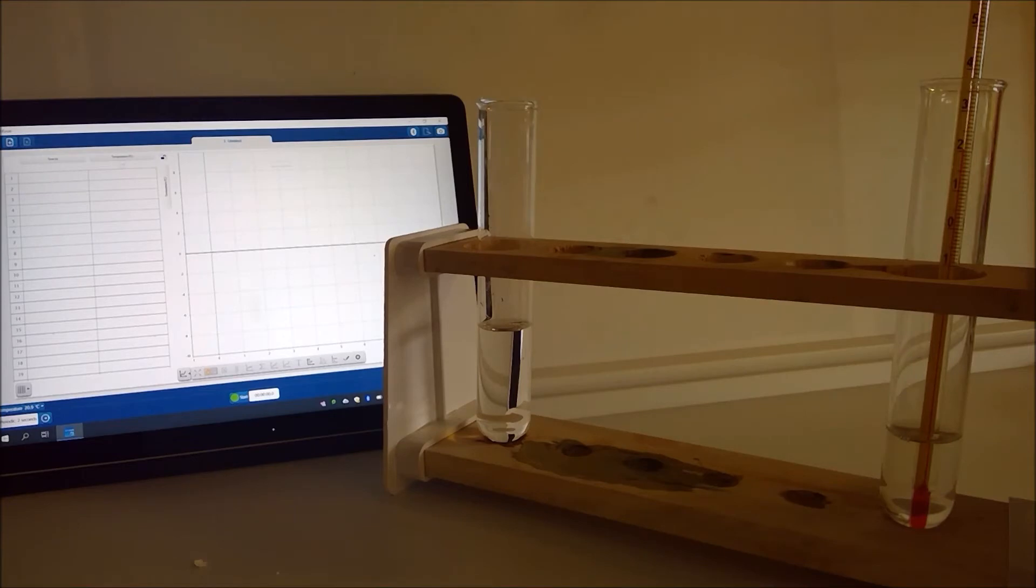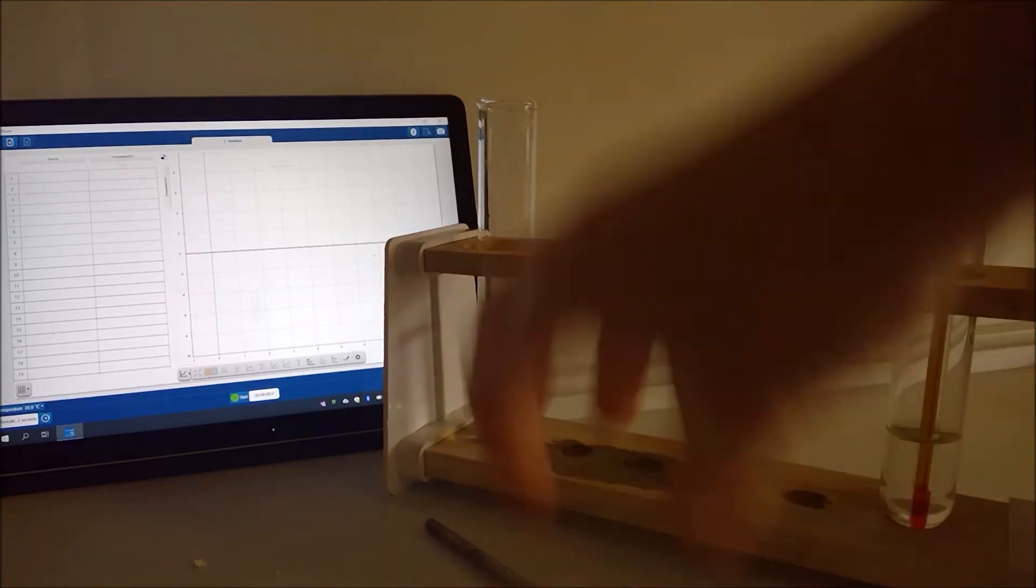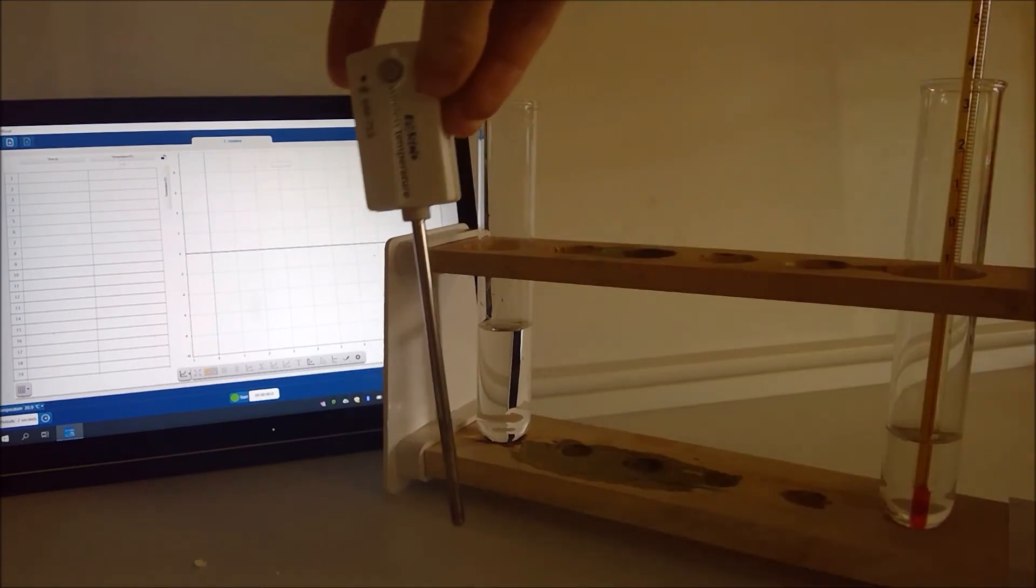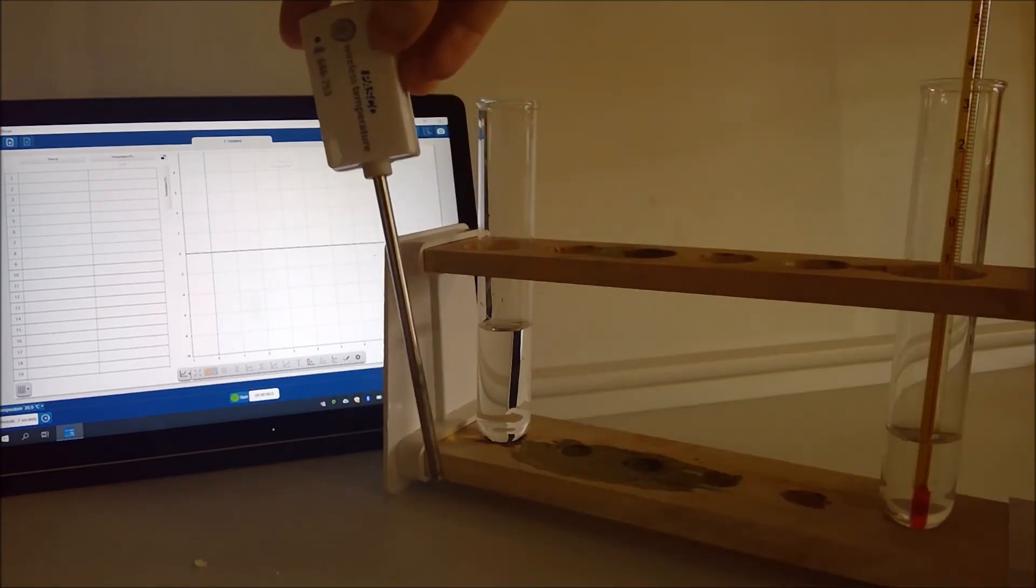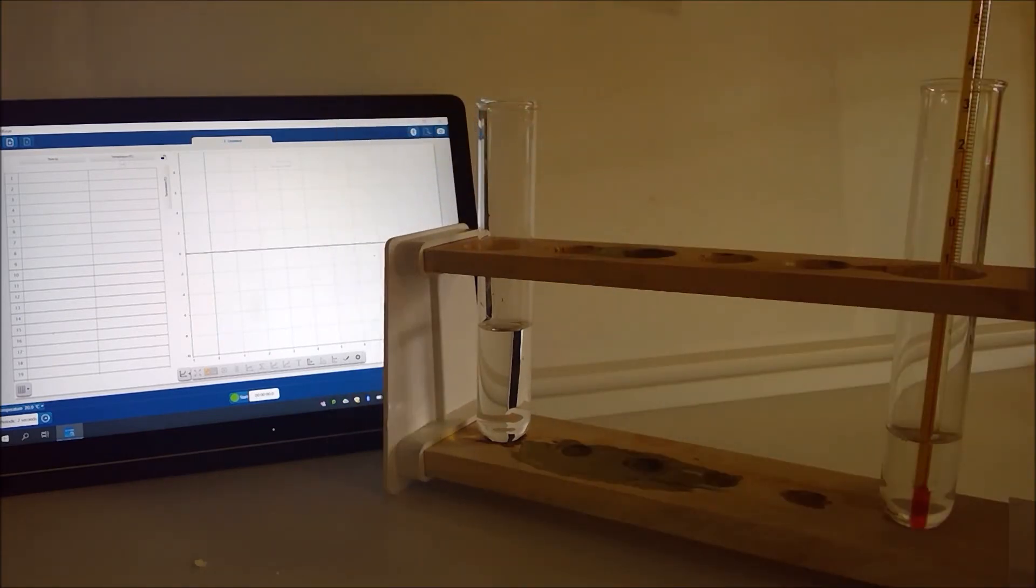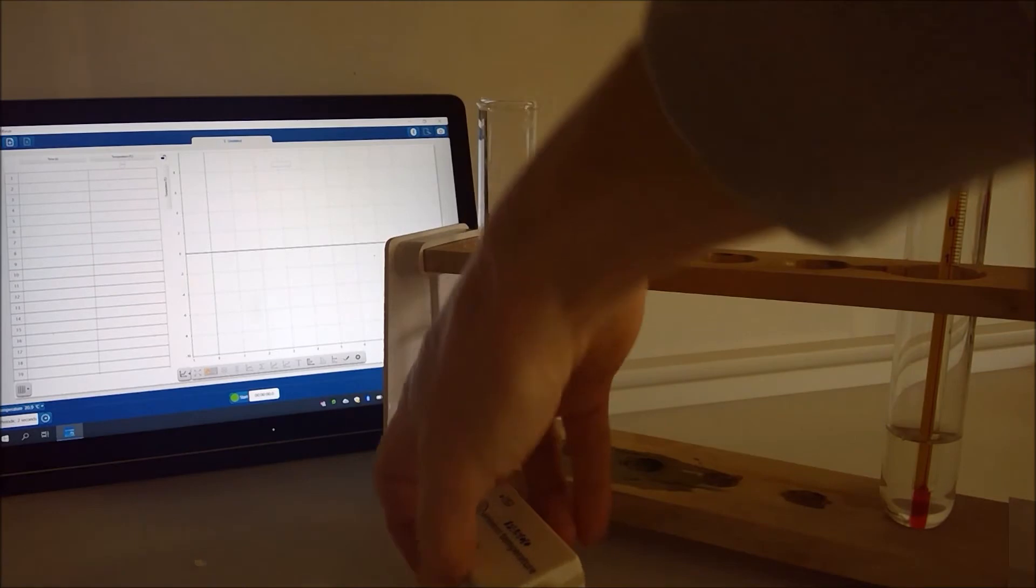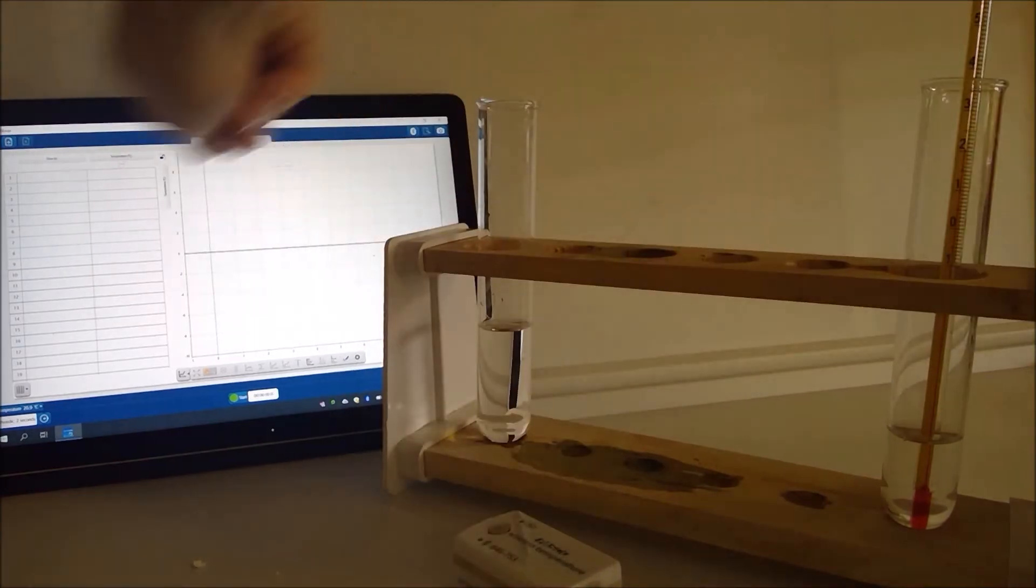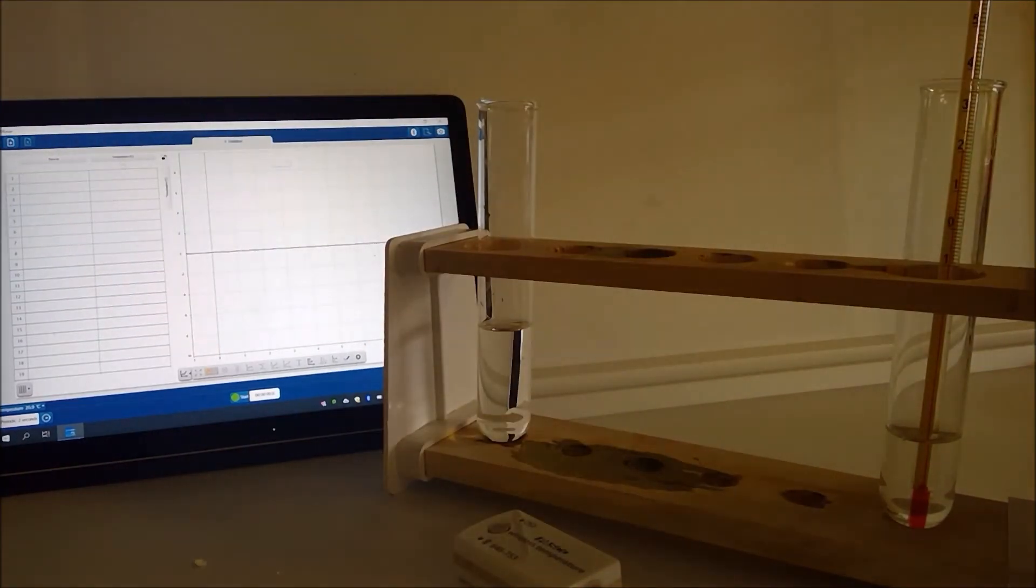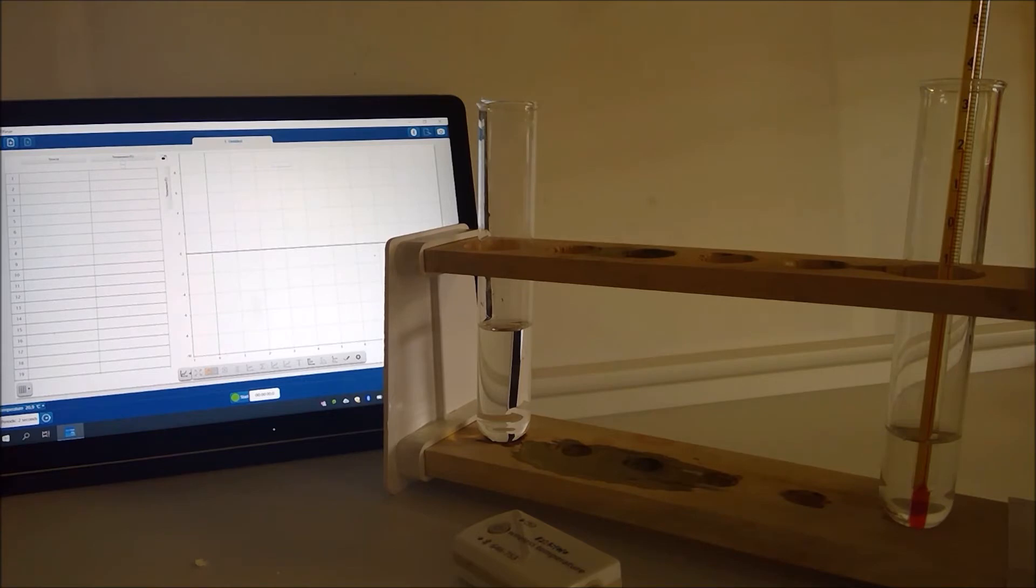Now because you can't see the thermometer very easily what I thought I would do at the same time is link this up with a data logger. So we have a temperature probe here so alongside putting the regular thermometer into our mixture I'm going to pop this in as well and over here we've got an app that is linked to the data logger and that is going to record the temperature every two seconds. So that's just going to make it a little bit more visual.